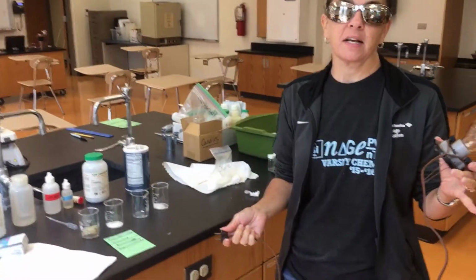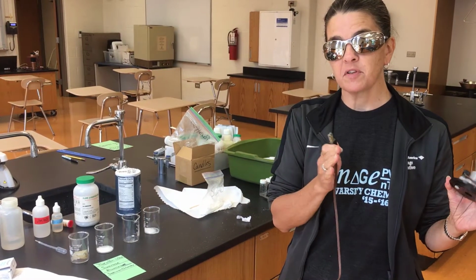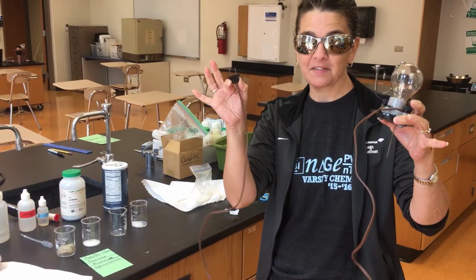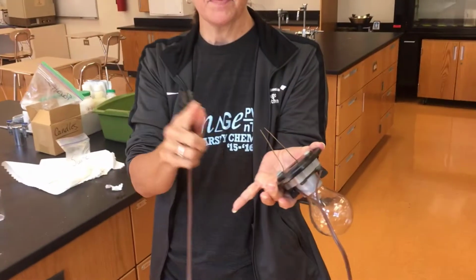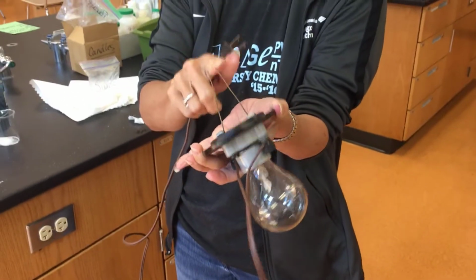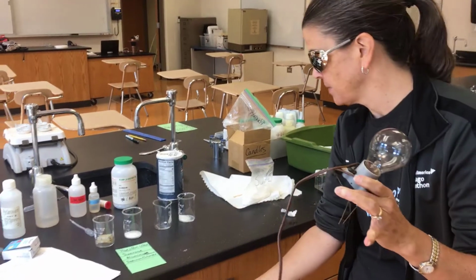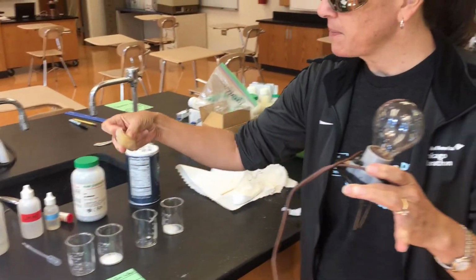Okay, so now we're going to test conductivity of our known samples. And conductivity can be tested both as of the pure undissolved sample, or if the sample dissolves of that particular sample as it's dissolved. Now, we don't have a conductivity meter today. We have this light bulb that you'll notice I don't have it plugged in. If I plug it in and I connect these 2 wires, then my circuit will be connected and my light bulb will light up. Okay, so I'm going to be really, really careful not to connect these 2 wires with myself. Okay, so plug it in, and let's first test our paraffin wax.